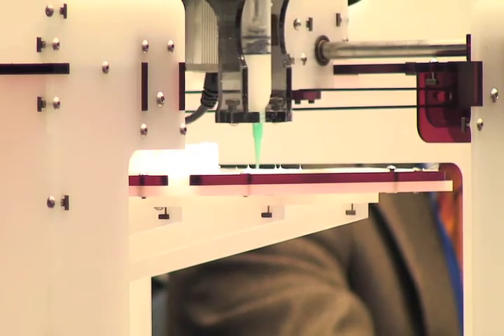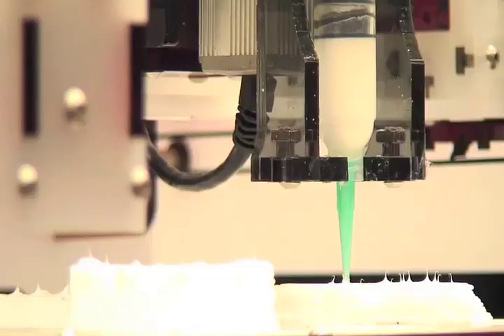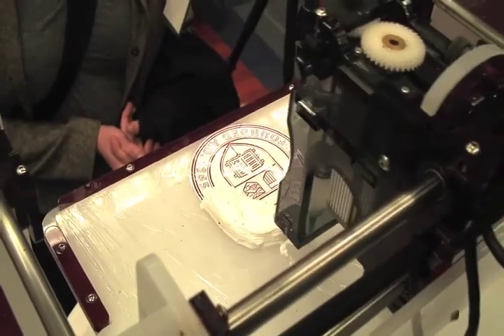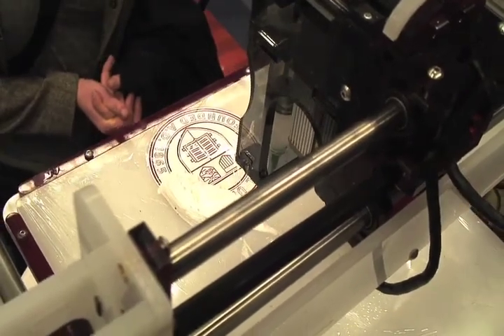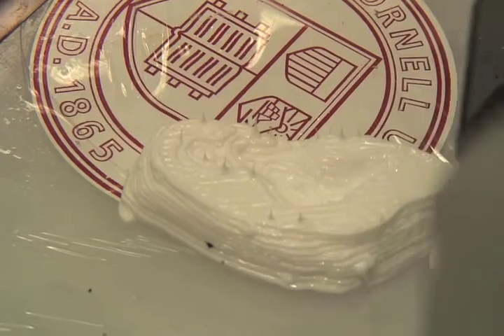The process doesn't end with the printing. Normally we would print something like this and might even print it into a substrate that will allow it to be suspended and incubated. We'd have to incubate it for a while until it has appropriate properties, and only then implant it.